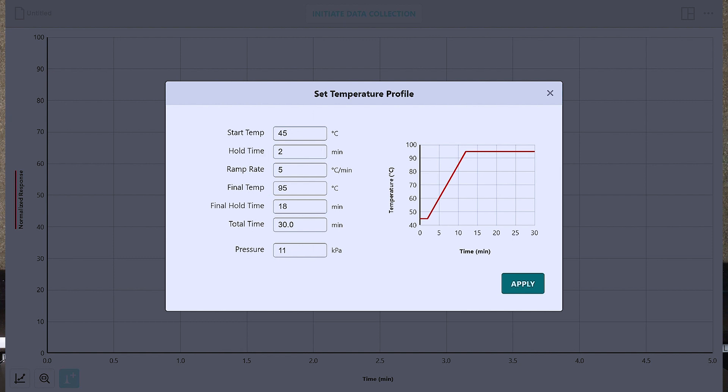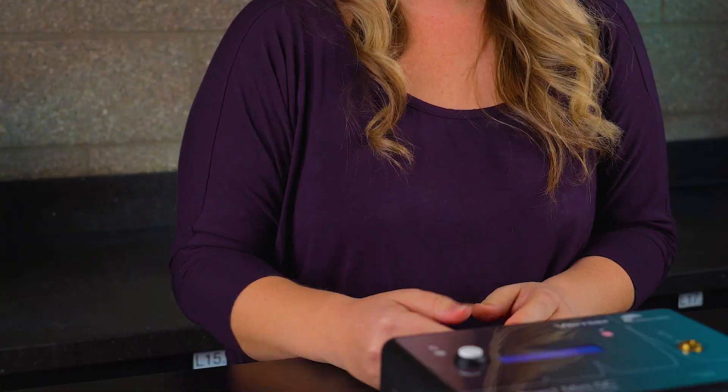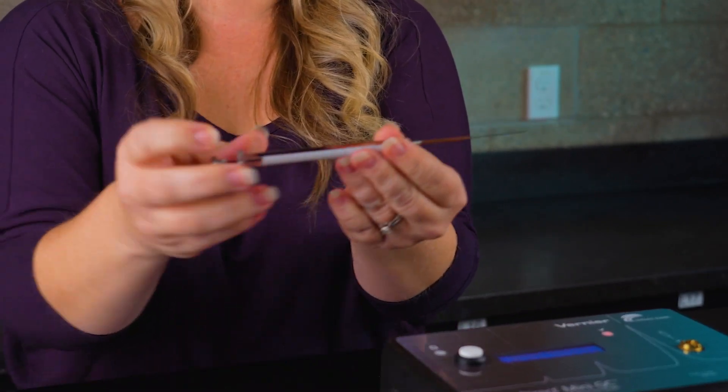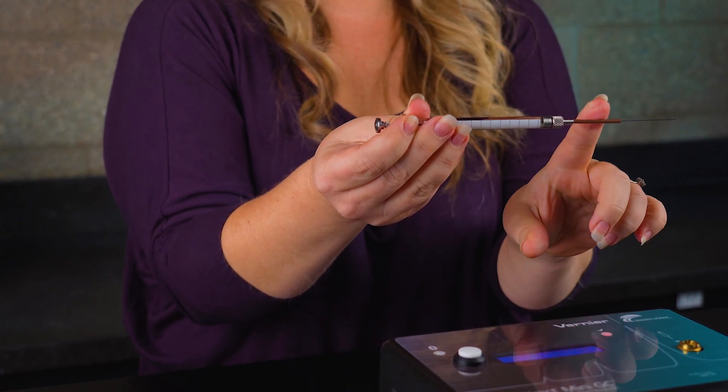The default settings are great for giving you a general idea of detection and separation limits, but it is by no means the only option. In fact, for the mixture I'm running today, I want to change the temperature and ramp rate and the pressure. Now we just have to wait until the instrument equilibrates to the appropriate temperature and pressure. While it's doing that, we want to make sure we rinse the syringe with the solution we are going to inject. It is worth noting that the syringe is quite fragile, so you will want to spend some time with your students walking them through proper syringe technique.